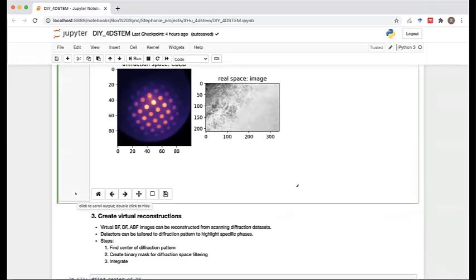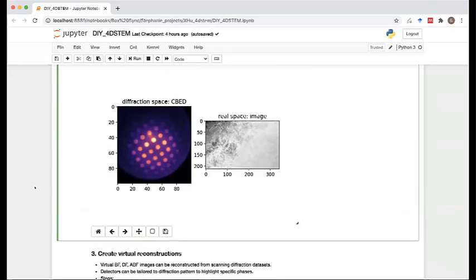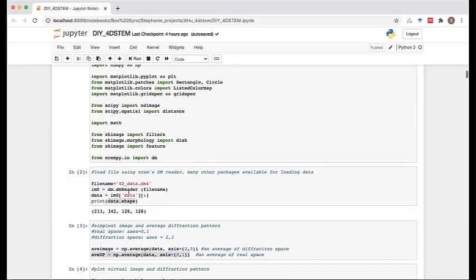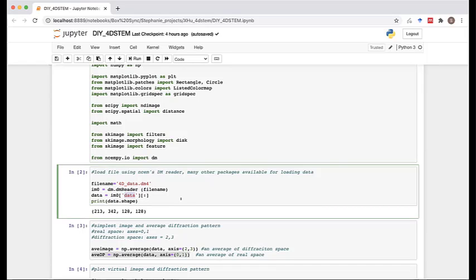Yeah, there was a quick question about the metadata. When you save the DM4 from Digital Micrograph, that usually comes with the metadata that you definitely can read from Python, right? With any of the readers, like either HyperSpy or in this case. So you could see it. If you maybe go a little bit up, instead of reading your data, there is another section where you can read basically just the metadata of that. So yes, it is accessible. That was the question. Yeah, exactly.